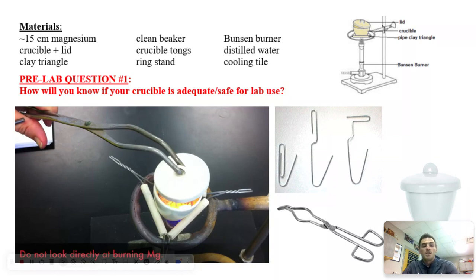But you probably want to mess with that a little bit before lab so you know, and then make sure the person with the steady hand is the one doing that in lab. If there's somebody who's not going to be a heart surgeon and is very shaky, don't let them do that, because a lot of kids will break their crucible once we get in there.